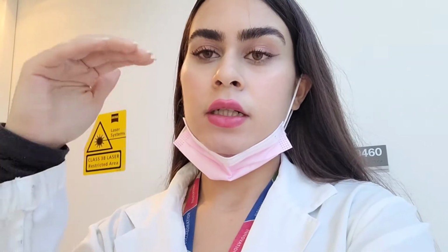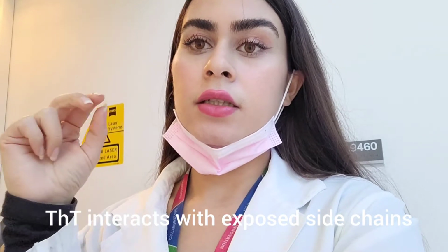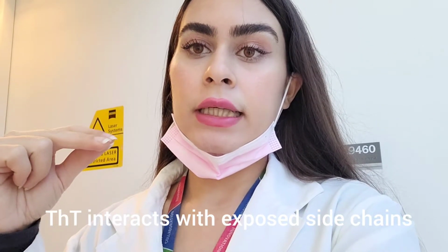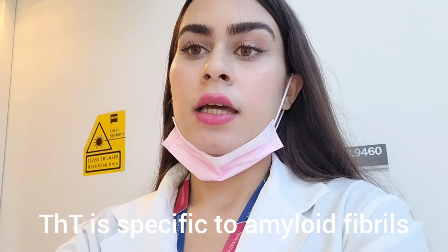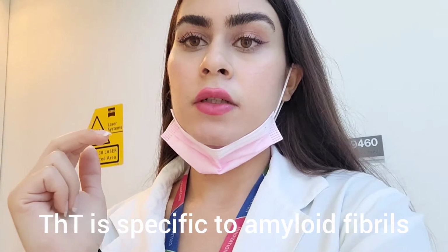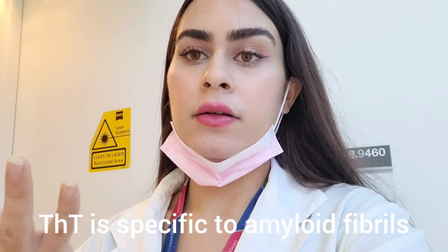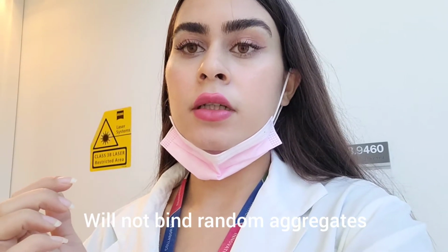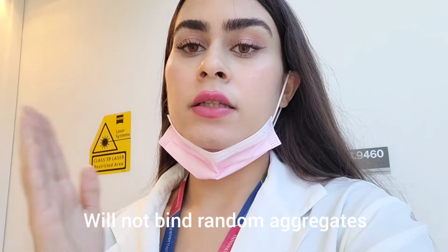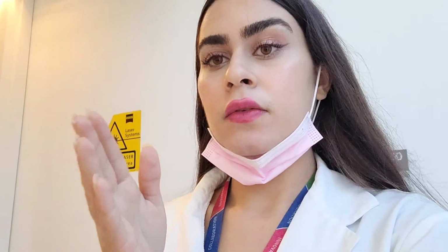The beta sheets will stack and the side chains will be sticking out, and Thioflavin T will go in between these side chain groups and it will give signal. And so it's very specific to amyloid fibrils, and because of that, if you form other types of aggregates or anything that is not an amyloid fibril, you will not get a signal. So this way you know that you definitely get formation of the amyloid fibrils.